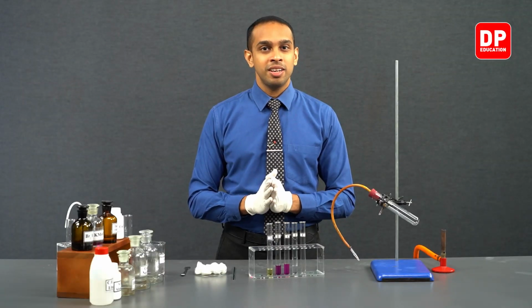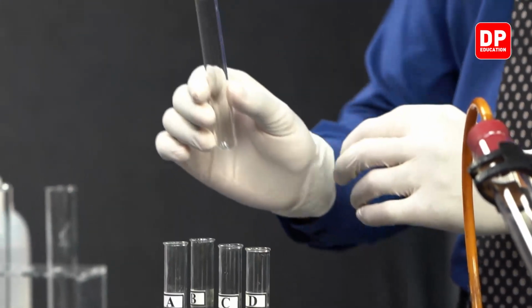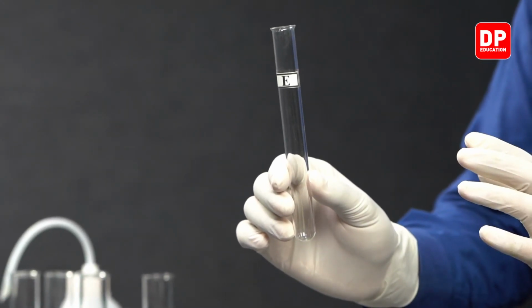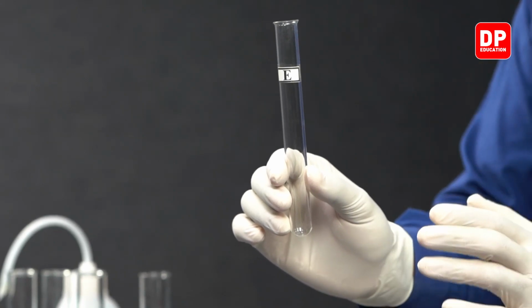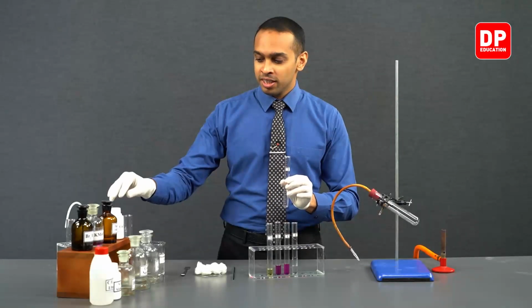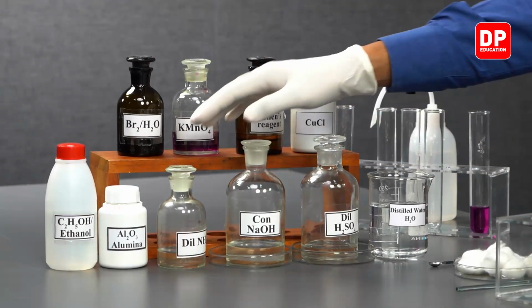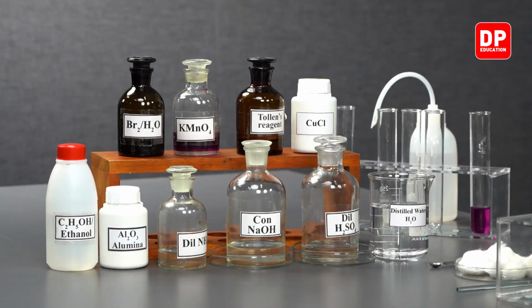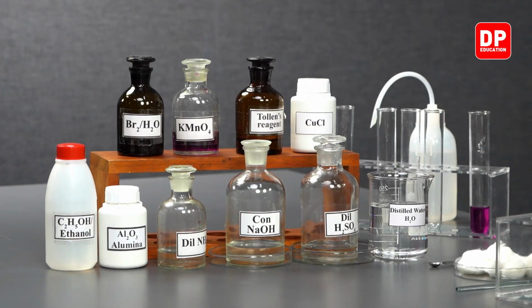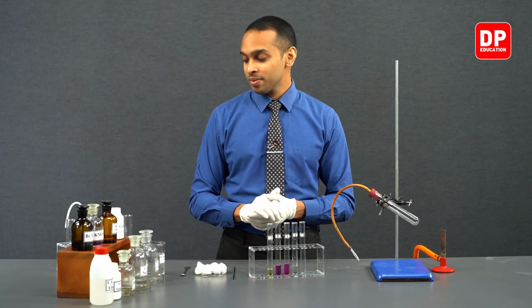Now students, let's move on to our test tube E. Now the test tube E should contain ammoniacal cuprous chloride. We have cuprous chloride here, we have distilled water and ammonia. So we can now move on to produce ammoniacal cuprous chloride.